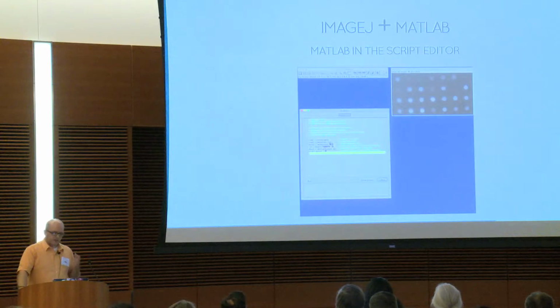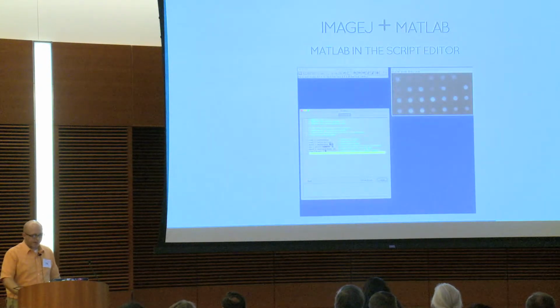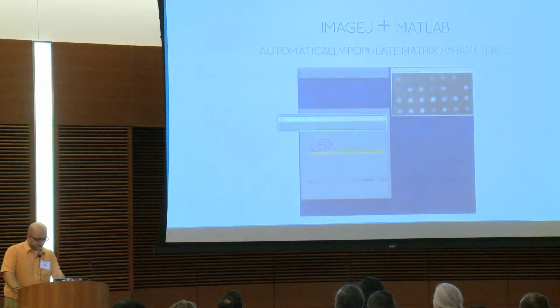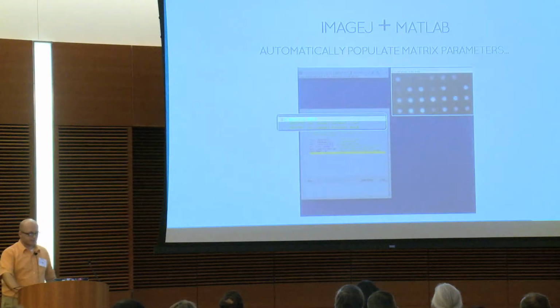From the other direction, from the ImageJ perspective, this is the ImageJ script editor. This script is pretty simple. It's just going to create a mask from this image, dilate it, and apply it to the original image. If anyone's interested, the script is a template that's available inside of the script editor. But what I want to focus on here are these @parameters that Curtis was talking about.